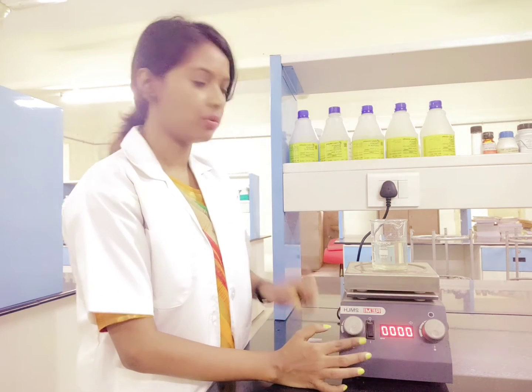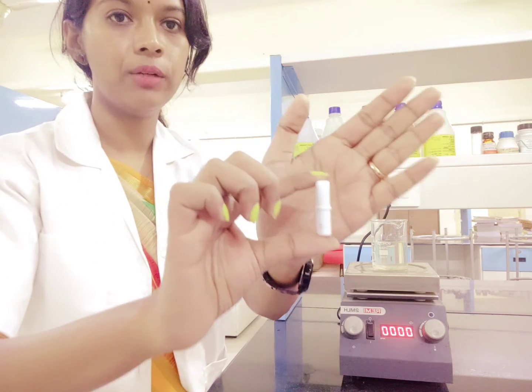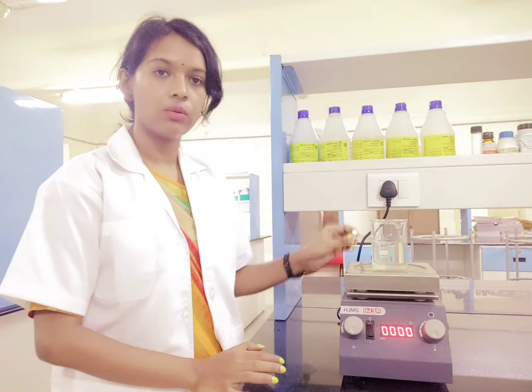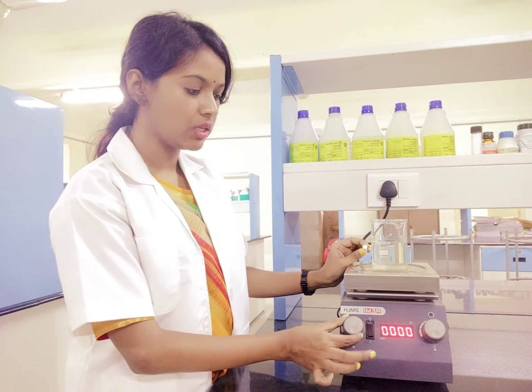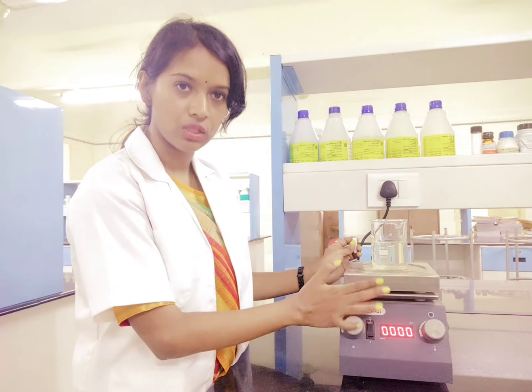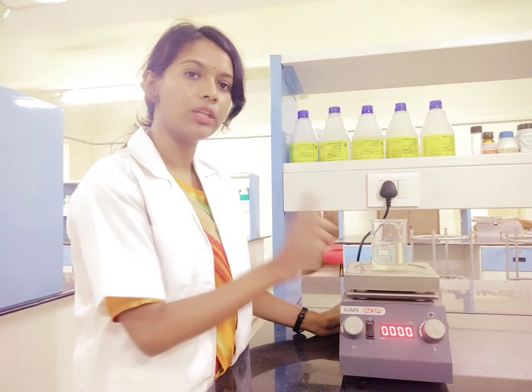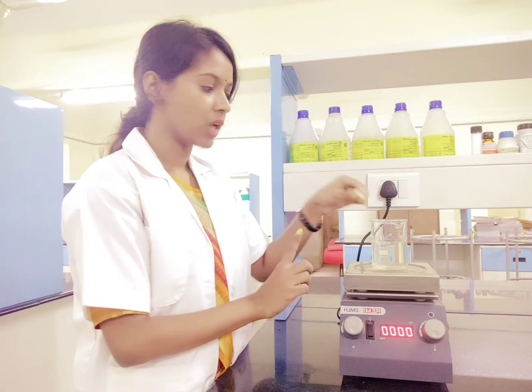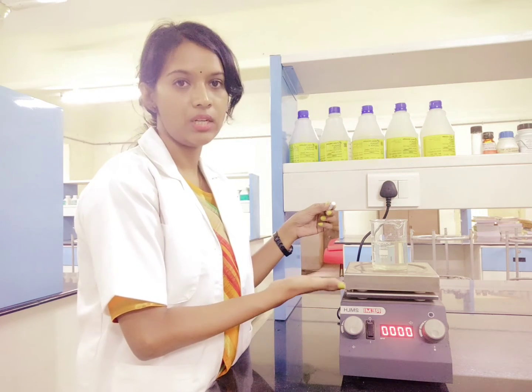Before increasing the speed, you have to remember that you have to keep one magnet bead — this white one, which we call the magnet bead. You have to keep this magnet bead inside the sample in the beaker itself. Once you put it and increase the speed, the magnet bar present inside below the plate keeps on rotating along with the motor, and the bead on top in the glass beaker rotates along with that bar.